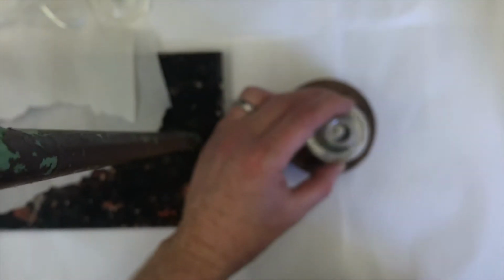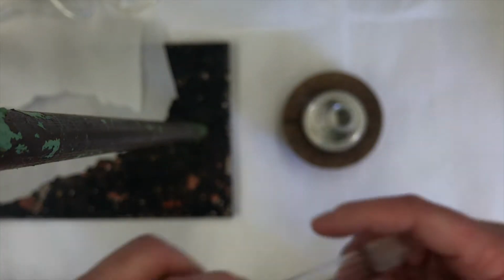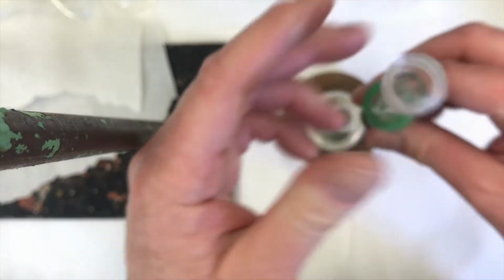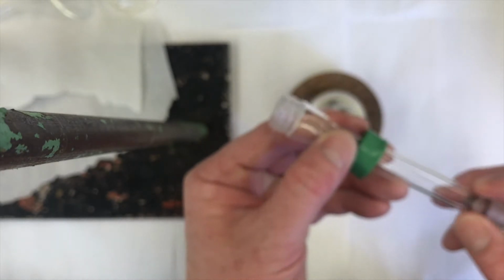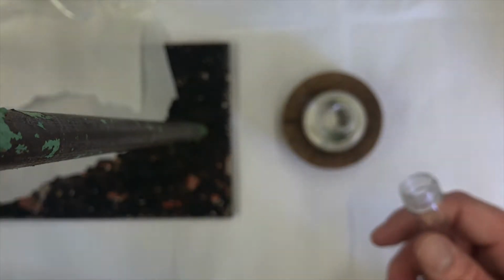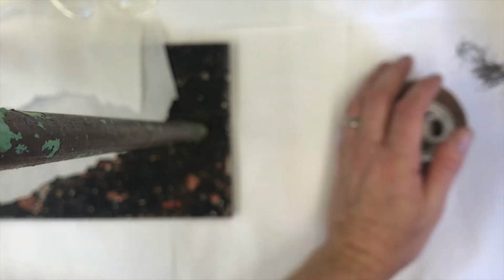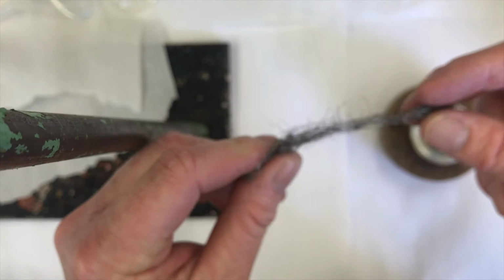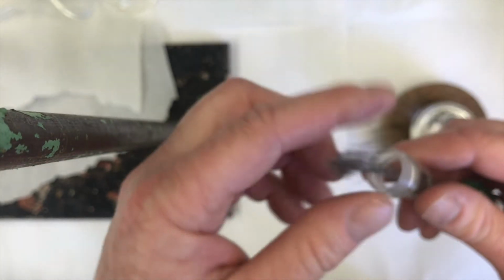Okay, and then the next thing we have to do is prepare our column. If I just added this air condenser to this, it would be a simple distillation, but I'm going to make what's called a fractional distillation. I'm going to add a packing. So I'm going to add this steel wool as a simple packing. So I'll just stick a little steel wool in my air condenser.